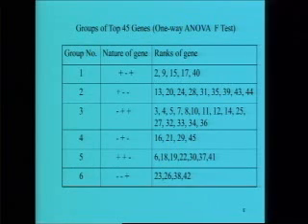So using exactly similar techniques, strip charts and the p-values of pairwise t-tests, we can divide these top 45 genes, top according to the one-way ANOVA test, into 6 groups. What are those 6 groups? The 6 groups which indicate the genes which have different profiles in the 3 groups. So rank 2, rank 9, we have seen already that they are of the type plus, minus, plus. So 2, 9, 15, 17 and 40, these are the genes with these ranks which are expressed at a low level in the obese group and at an equal level in the remaining 2 groups.